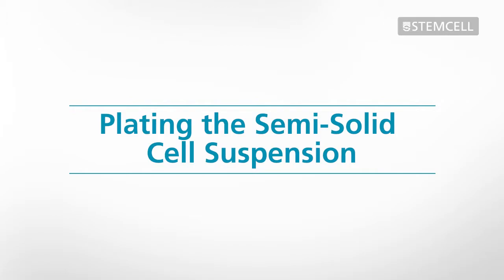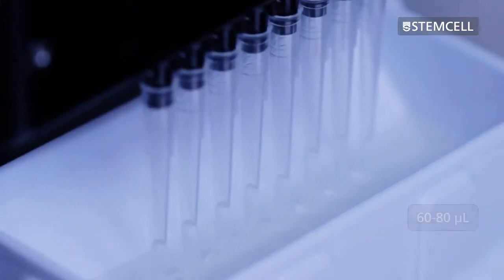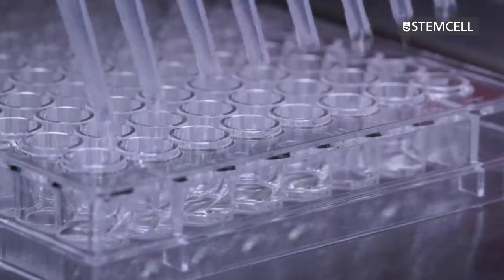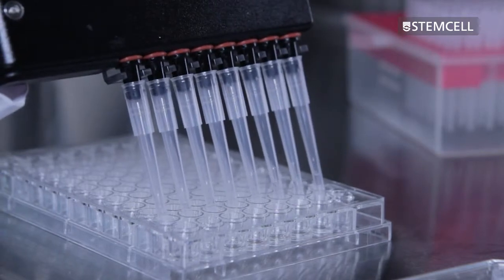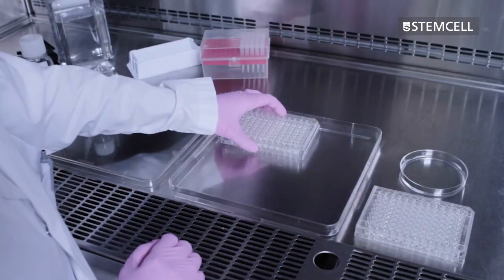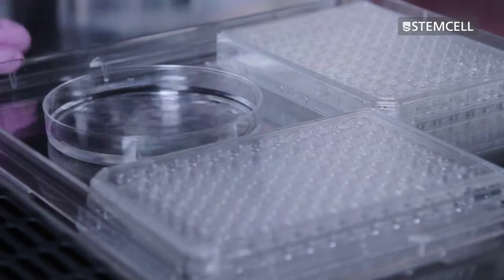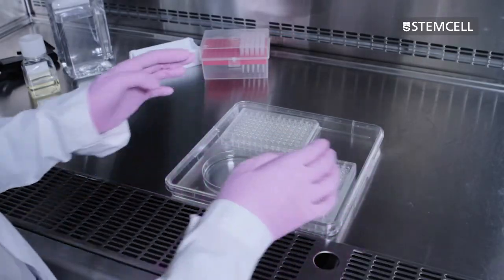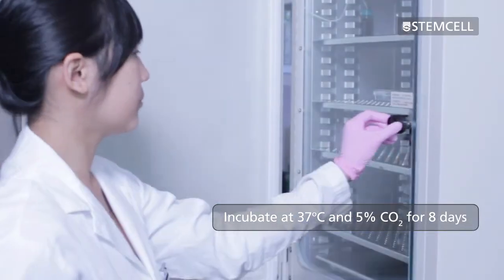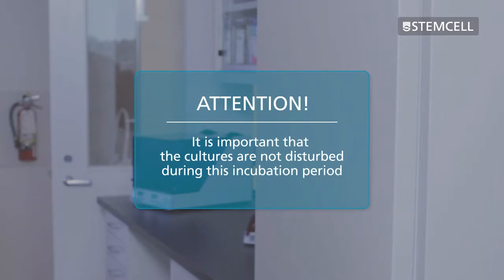Using a multi-channel pipetter with sterile, wide-bore pipette tips, dispense 60 to 80 microliters of the final mixture into each well of a 96-well plate. As the mixture is very viscous, it can be difficult to pipette; however, it is not crucial to dispense exactly the same volume into each well. We recommend placing the covered 96-well plates inside a larger dish along with an uncovered dish of sterile water. This will help to ensure that the cultures are well humidified. Place the cover on the large dish and incubate the cultures at 37 degrees Celsius and 5% carbon dioxide for 8 days. It is important that the cultures are not disturbed during this incubation period.